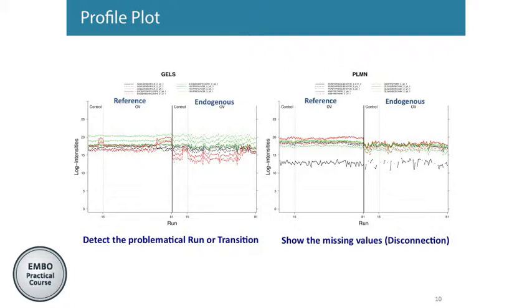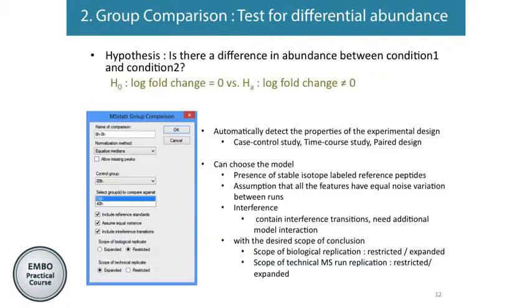So usually in an SRM experiment, we can expect quite similar variance, but for DDA data or SWATH data, we can see they have more fluctuation between the transitions. So this option assumes equal variance, and depending on your experiment, you decide whether that assumption is correct or not.